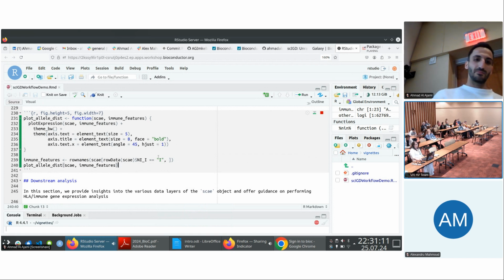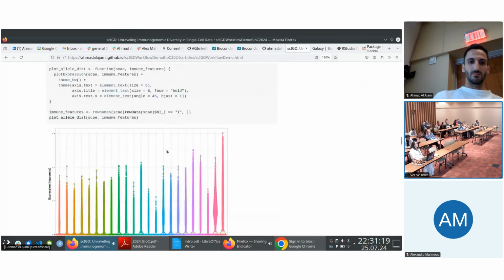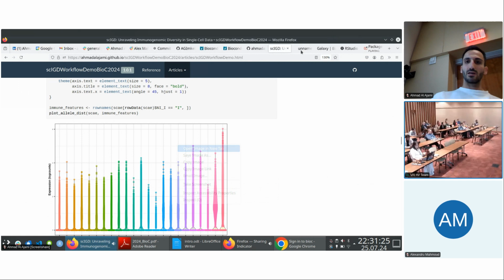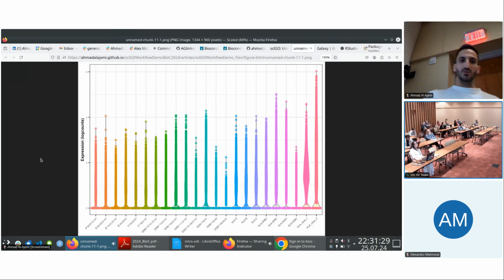While it's running, this is pretty much the kind of image that we're going to get. And okay, there it is.